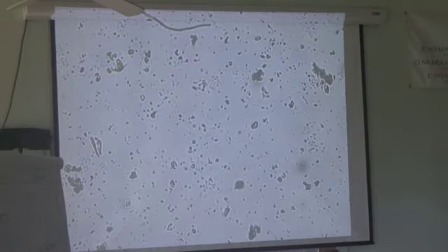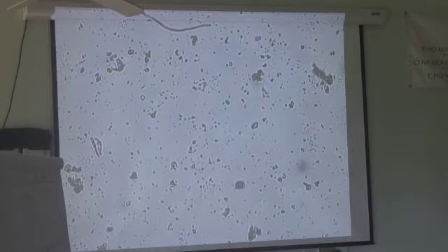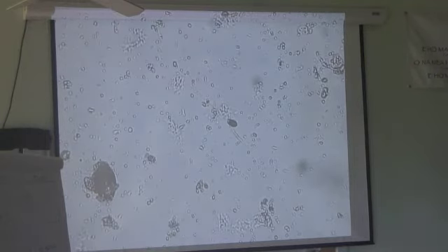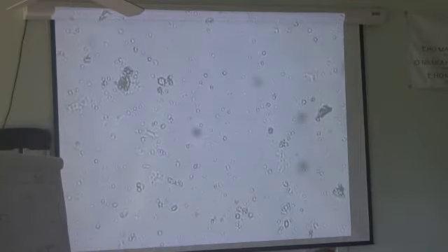Next field, with a nice strand up here. Focus on it nice and sharp. Nobody's out of focus. I can see space, but that's out of focus. So when he's really sharpest in focus, it's an actino once again. There's not picking up any sunshine. So, do you think we've seen enough fields in the sample to have a pretty good idea of what's going on here? We could do a quick scan.